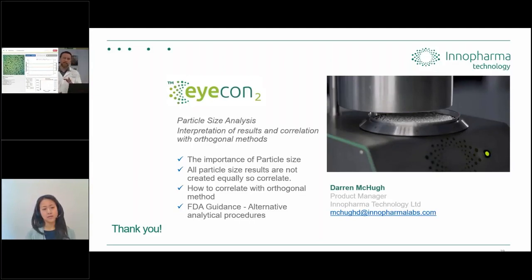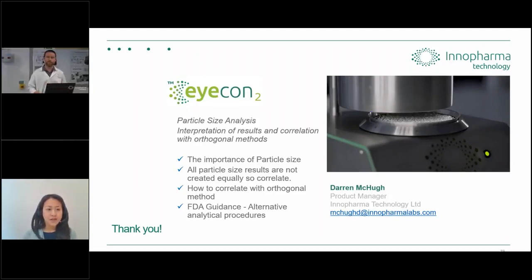Maybe this is a little bit outside of overlapping particles, but we would look into what material is being presented to the camera system. Is it representative of the process? Are we getting the full particle size distribution? And also, is it an accurate area to measure, in terms of there being no blockages in the process or anything like that? Thank you, that's perfect.